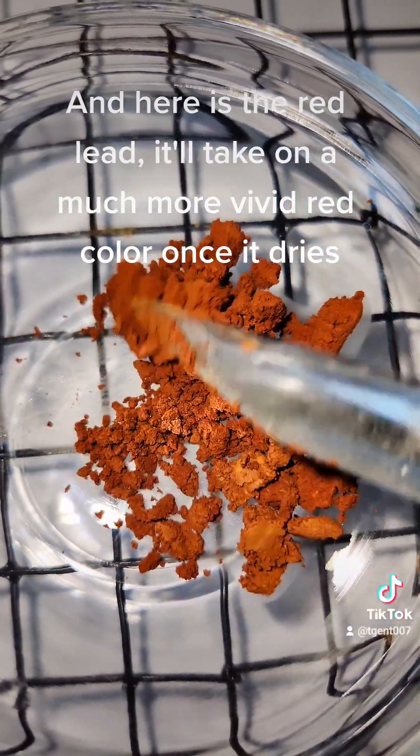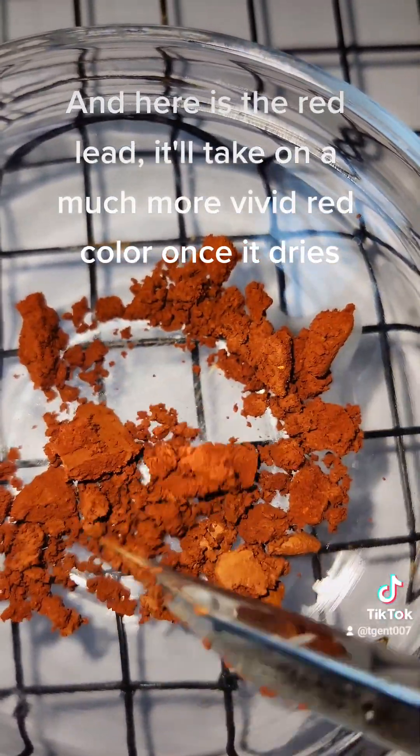And here is the red lead. It'll take on a much more vivid red color once it dries.